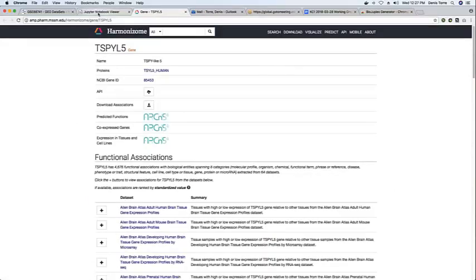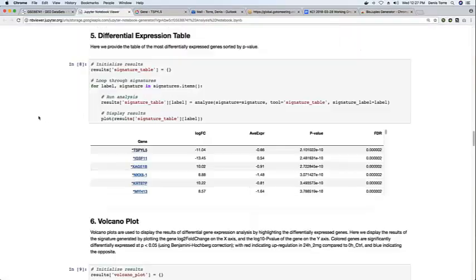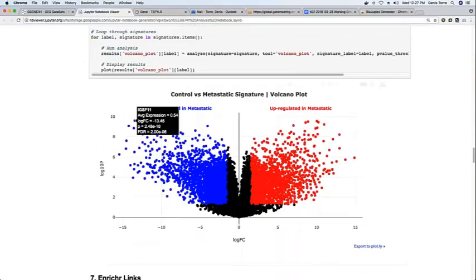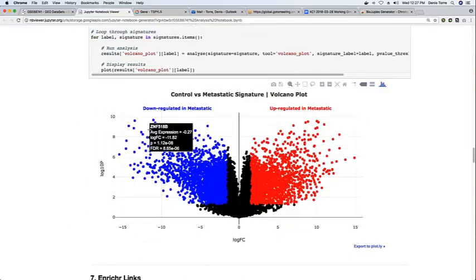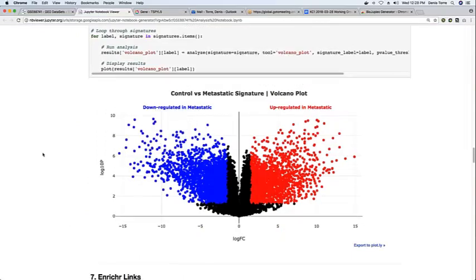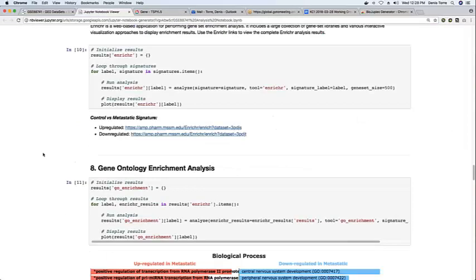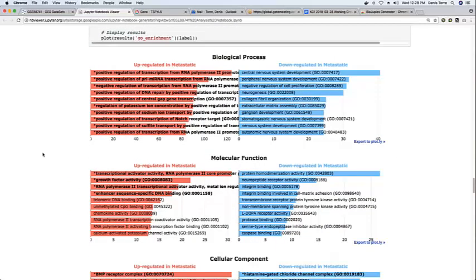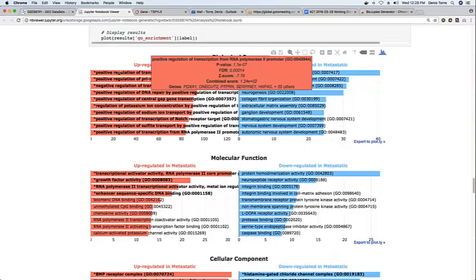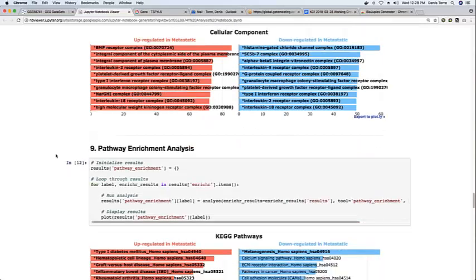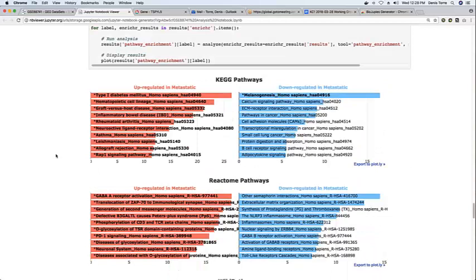We have interactive volcano plots showing the results of the differential expression. Pathway enrichment analysis. And several other analysis tools.